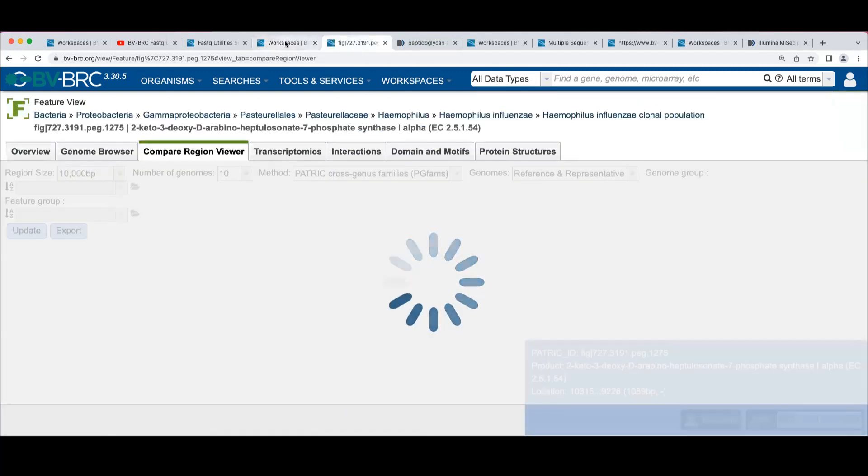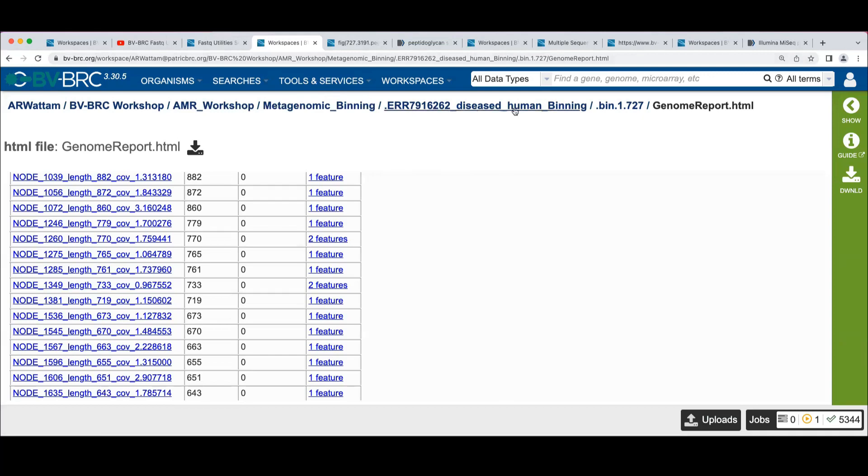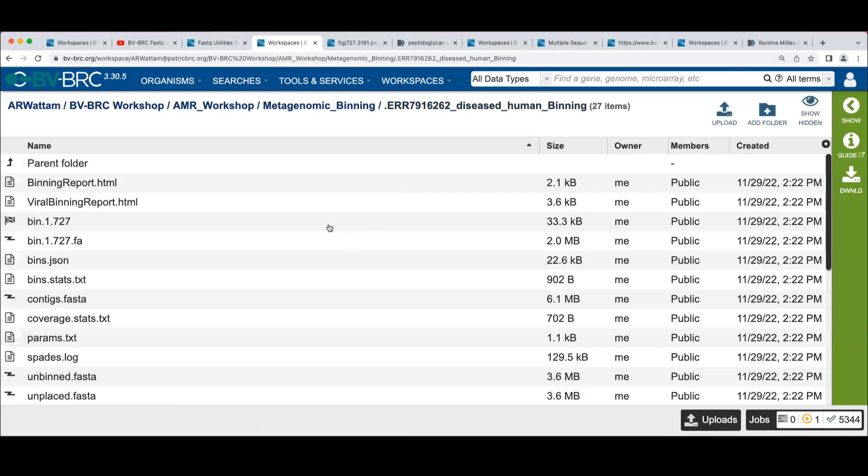And that's still grinding away. I'm going to go back here to the job.